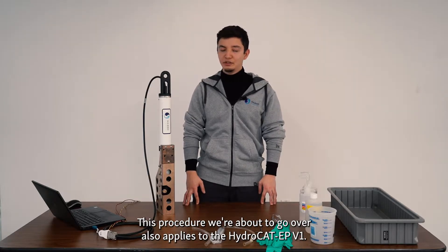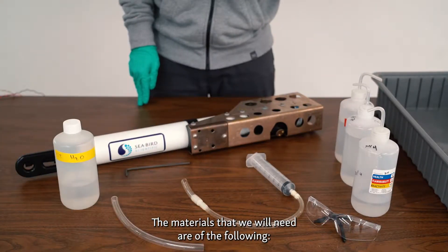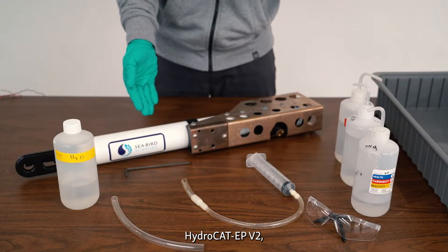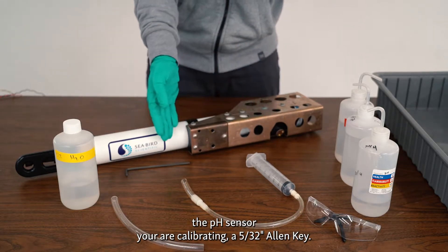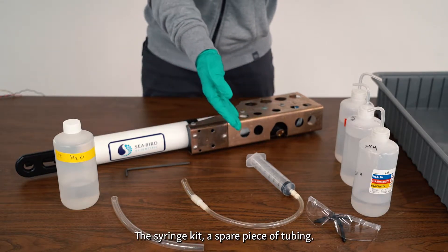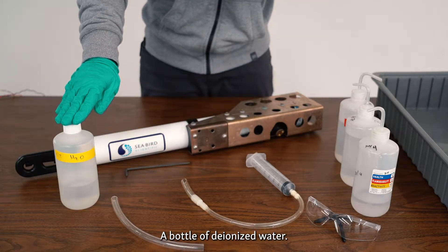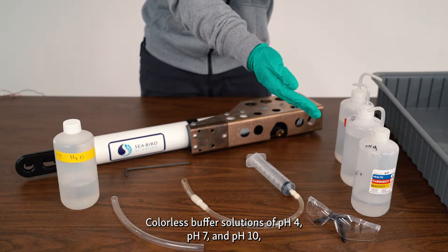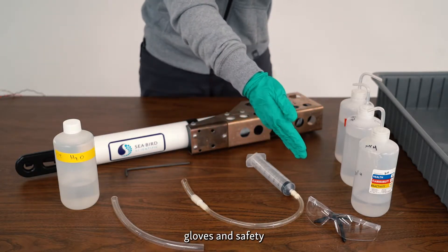This procedure also applies to the HydroCAD EP-V1. The materials that we will need are the following: HydroCAD EP-V2, the pH sensor you are calibrating, a 5/32nd Allen key, the syringe kit, a spare piece of tubing, a bottle of DI water, colorless buffer solutions of 4, 7, and 10, and gloves.